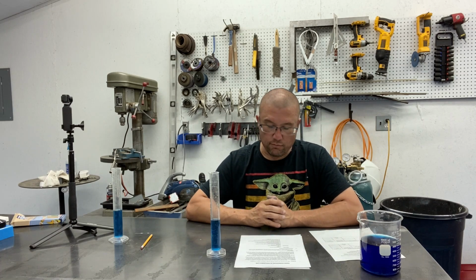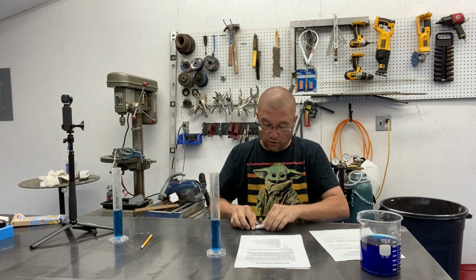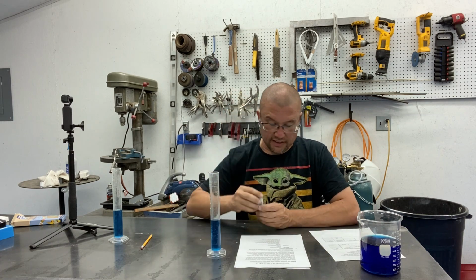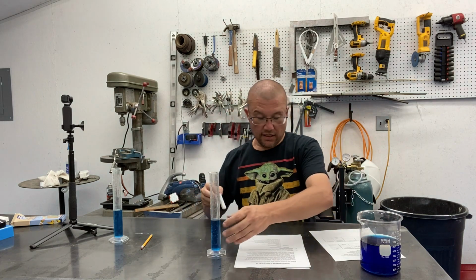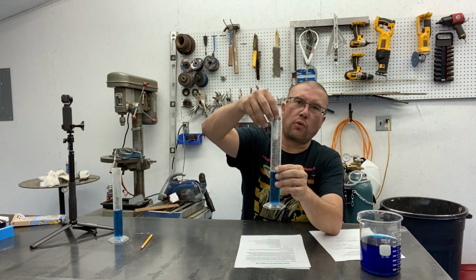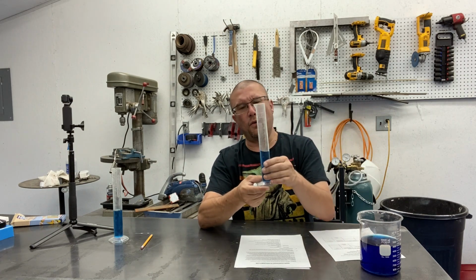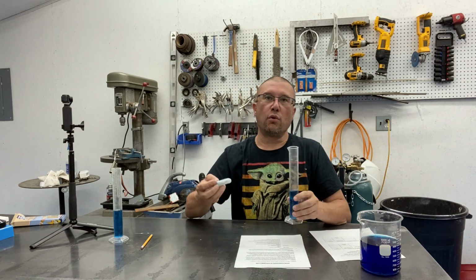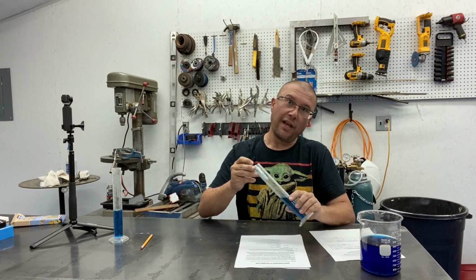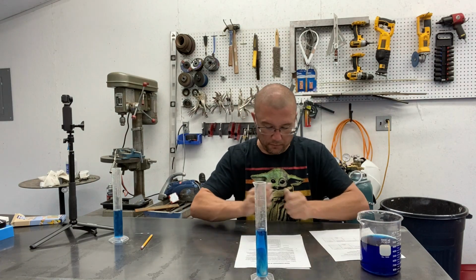Step 5 says mold the clay into the shape of a cylinder. So I'll take our little piece of clay here and I will turn it into a cylinder. So now we've got a cylinder. Step 6. Slowly lower the clay into the graduated cylinder. You don't want to drop it in because you can splash stuff out if you do so. And although this is water, so it's safe, if you're doing an experiment with acid or something and you splash it on you or your neighbor, people aren't going to be happy. So you've got to follow the safety rules as well.